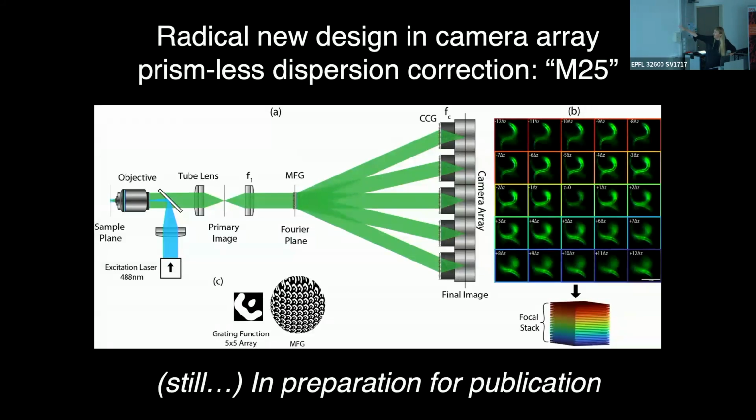So you see in front of every camera here, they all have little lens mounts. So you put a little lens in the camera, and the lens has a little filter mount. I don't know how many photographers there are here who shoot with regular cameras. In that little filter holder, you put one of these blazed gratings that I talked about, where each little grating feature is this little prism-like thing. And then that's a rotatable mount, so you just rotate it in the right direction. And now you can skip that prism I showed. So now you have a chromatic dispersion corrected diffractive optics imaging system with just that pair of gratings.